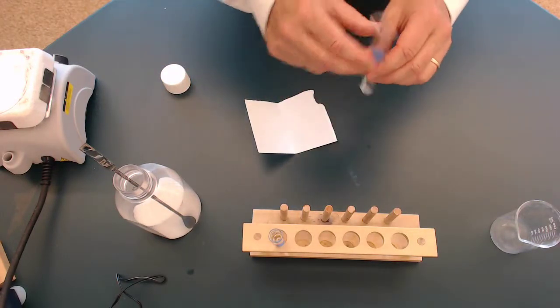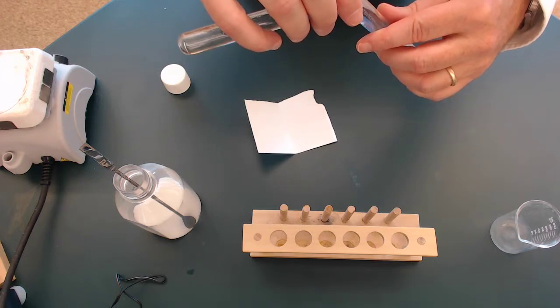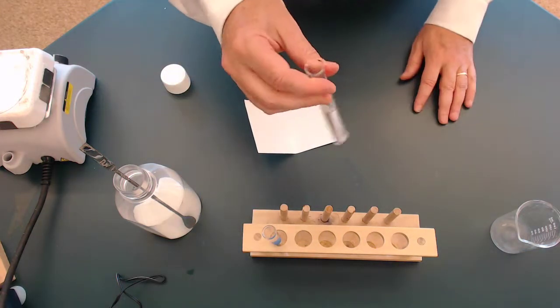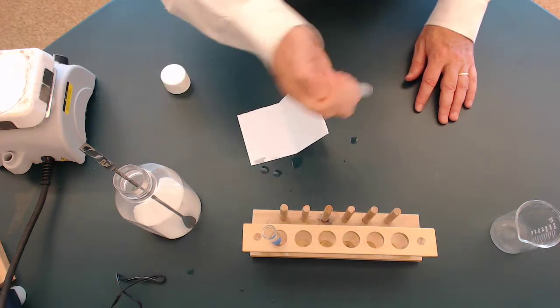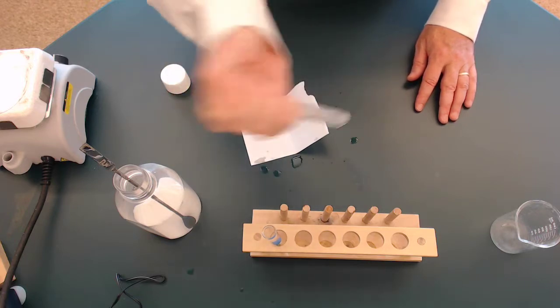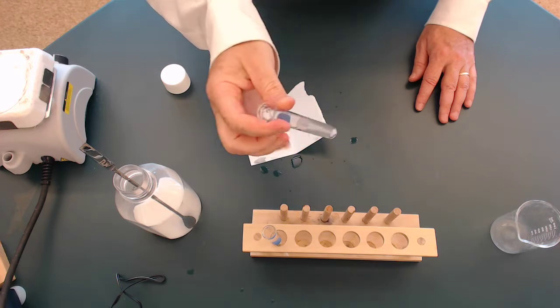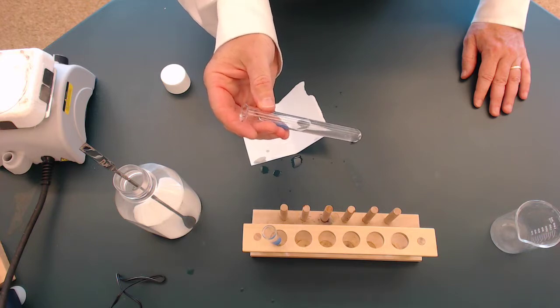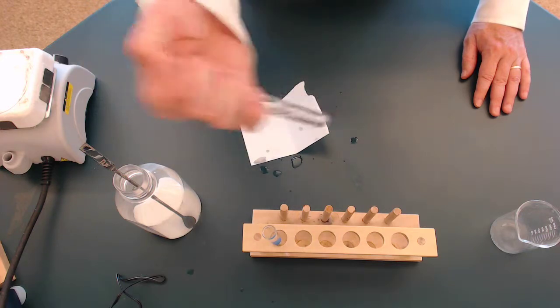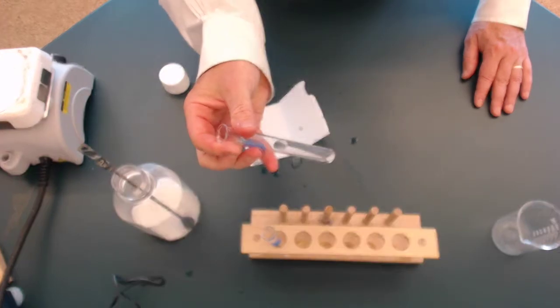And we notice that there it is in the test tube. Then we're going to add about 10 milliliters of water. Just tap water, doesn't have to be distilled water. And we're going to stir that up a little bit. It's just water, so it's not that big a deal. Once we have it stirred up like that, you can see that the salt has dissolved. There's some bubbles on there, but that's from the shaking. But basically, the water looks the same, it just is now salt water.